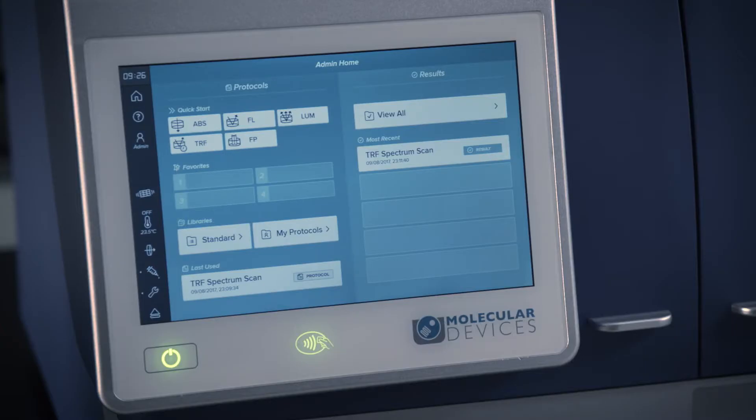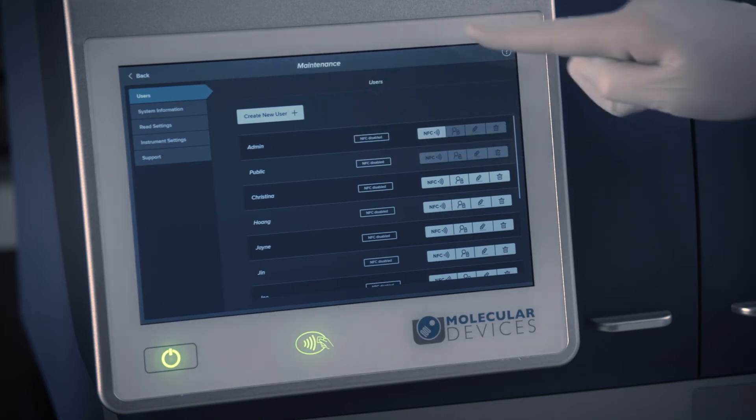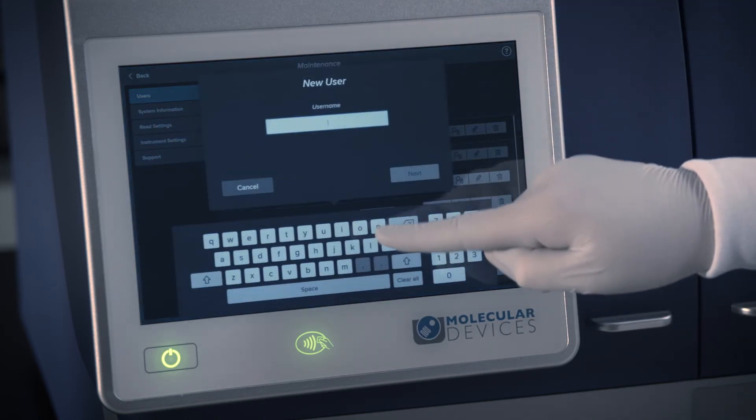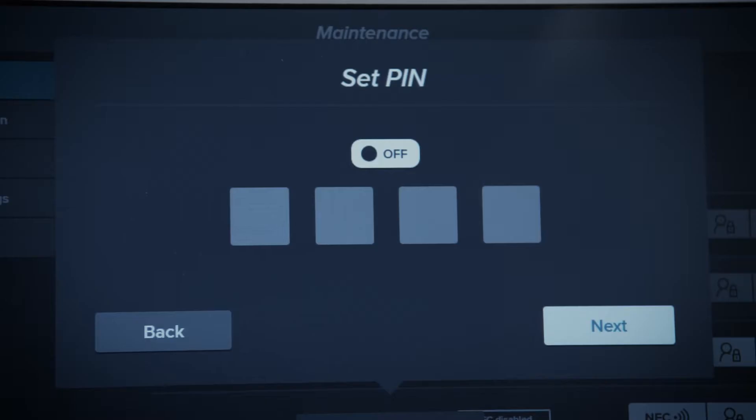To create a new user or modify an existing user, touch the wrench icon and then touch Users to display the Users tab. Touch Create New User and follow the wizard to enter the user's name, determine whether or not the user account should be PIN protected, and pair an NFC tag to the user's account.